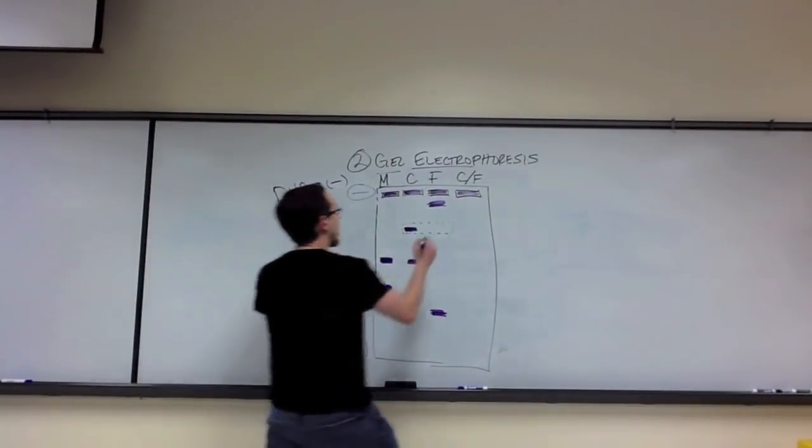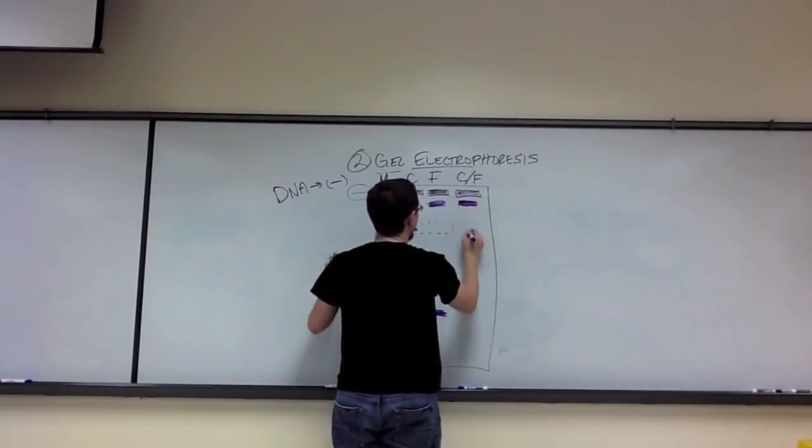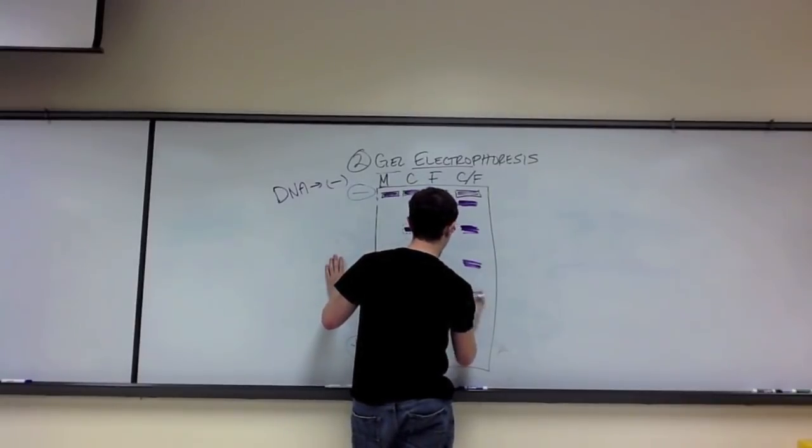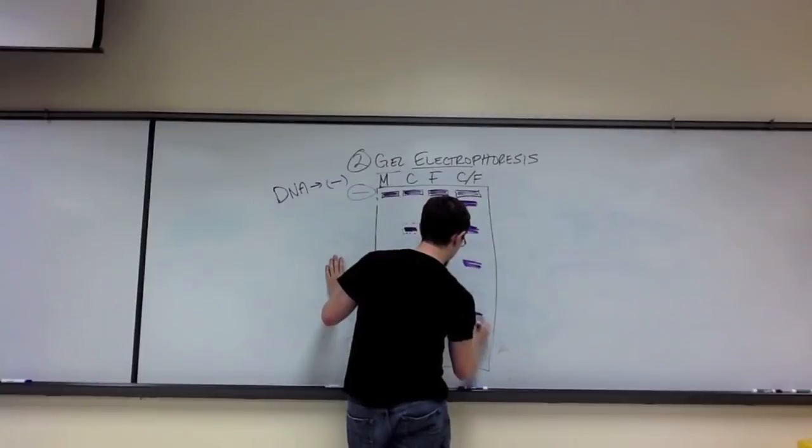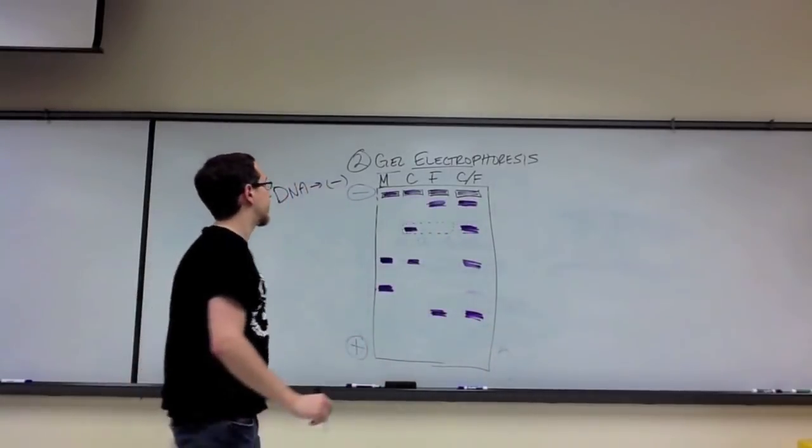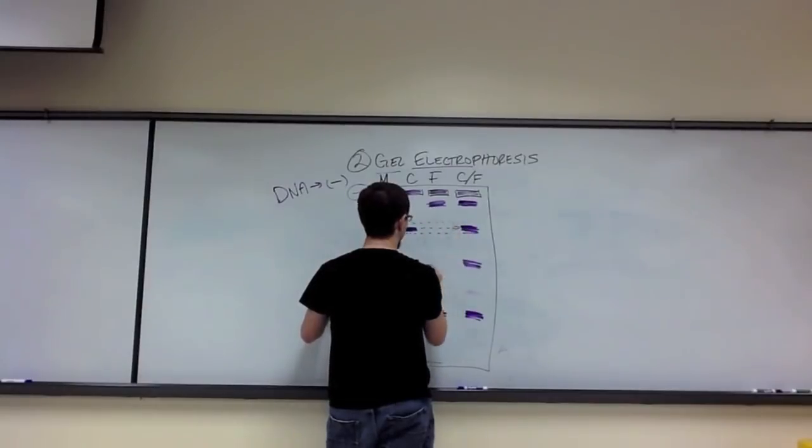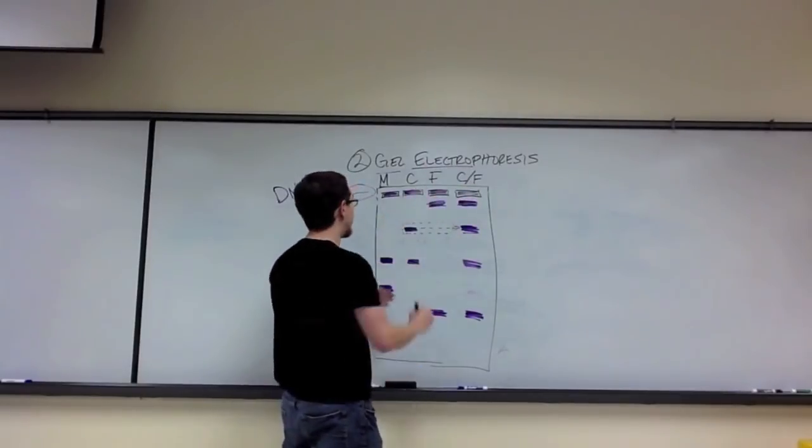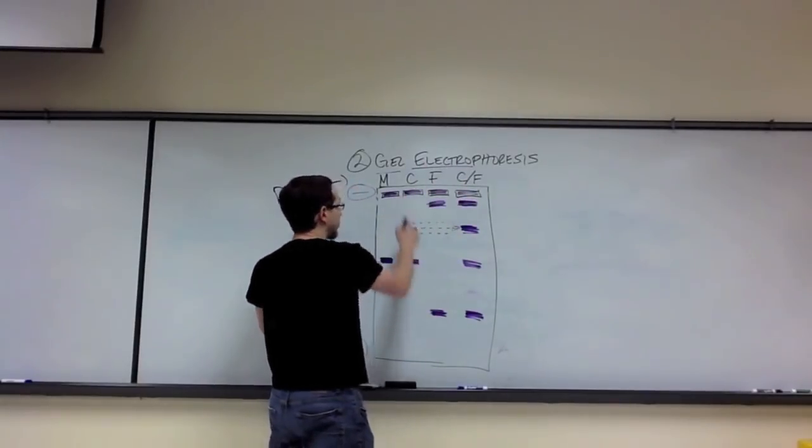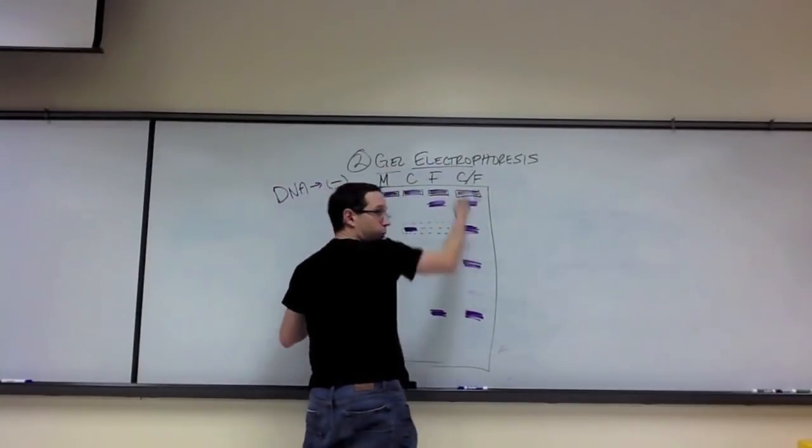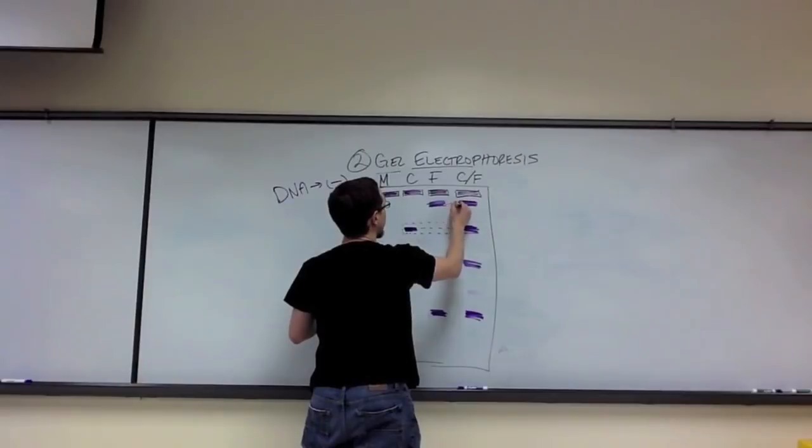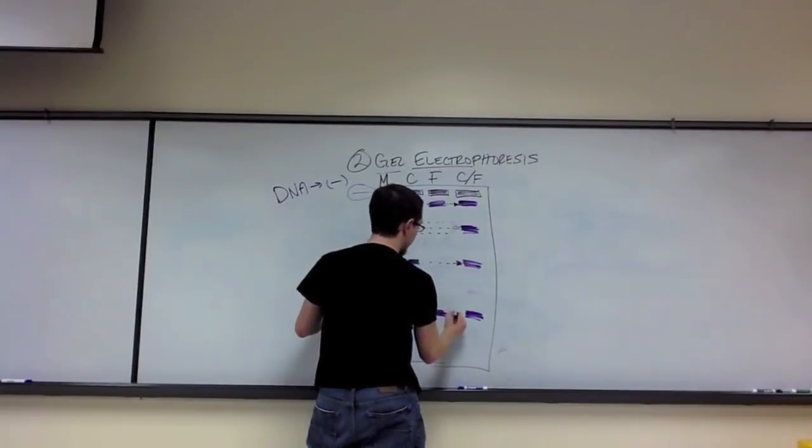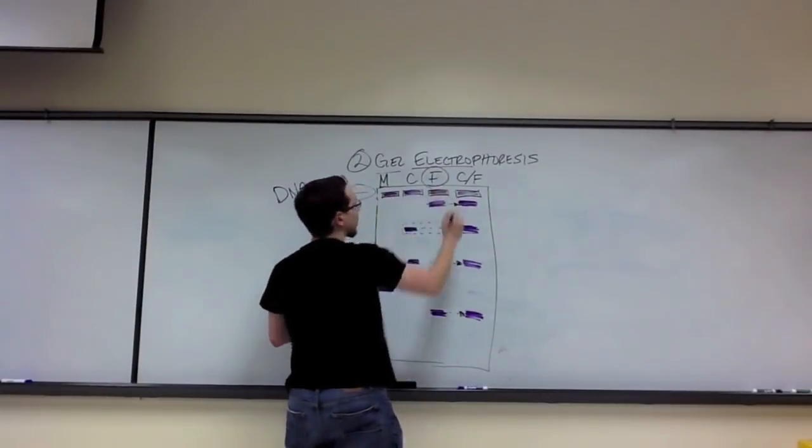A lot of students make the mistake of, in this lane, seeing this and saying, oh, he must be his father because this band is here. Well, that band, of course, is going to be there because the mixture was child DNA and father DNA, and because these two bands were in the child's DNA in the first two, they're going to, of course, be in the mixture here. The father donated this band in the mixture, the child donated this band in the mixture, and the male donated this band in the mixture.